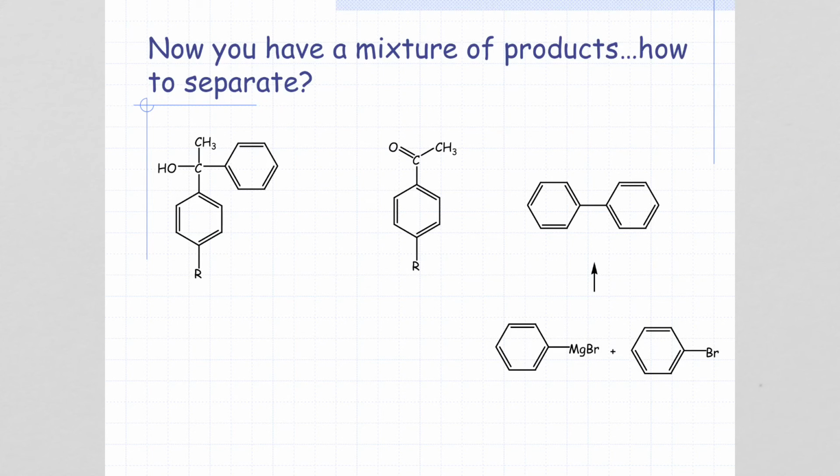Now, as I mentioned, we're not going to do the purification step where we do column chromatography of this, but we will do thin layer chromatography. And at this point, you're going to have a mixture of your products. You're going to have your alcohol. Hopefully that is what most of what you have is the alcohol, that's your desired product. You may have a little bit of starting material left over. And it's also highly likely that you're going to have a compound called biphenyl.